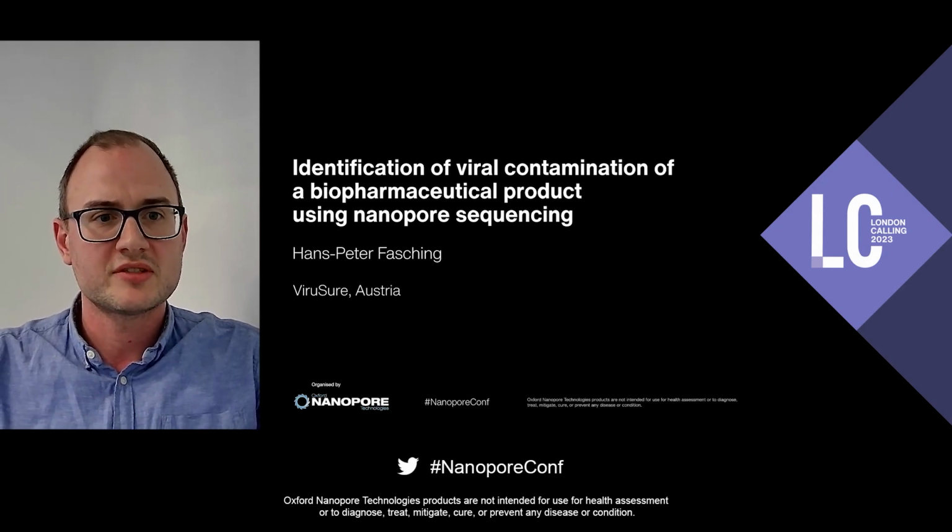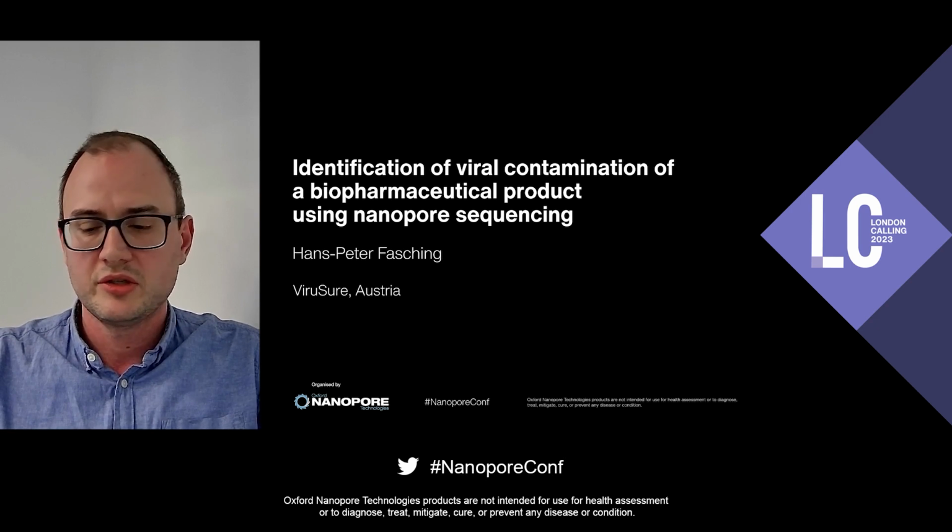Today I will present you a case study of our identification of a viral contamination in a biopharmaceutical product using nanopore sequencing.